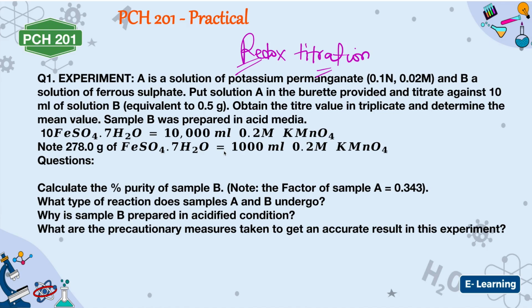That one that has EDTA is called complexometric titration. The complexometric agent there is EDTA, for the previous one we did. But this one is redox titration. It involves potassium permanganate. This titration does not need an indicator. Why does it not need an indicator? Because potassium permanganate is a self-indicator. It is purple in color. Then when the endpoint is reached, it turns pale pink or colorless. Is that okay? So it does not need any indicator. Potassium permanganate is a self-indicator.